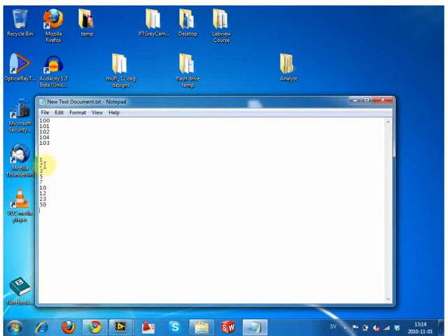So it starts with 1, and then it looks through the stack and says, does anything else have a 1? And okay, 10 has a 1. So let's move 10, and then 10 goes. In some cases it goes before, some cases it goes after. Labview actually puts it before because its second index is 0. So it would then order it like that, but then it's like, oh, I've got 12 too. So let me move the 12 and put it before this index too. So 12 would go here.